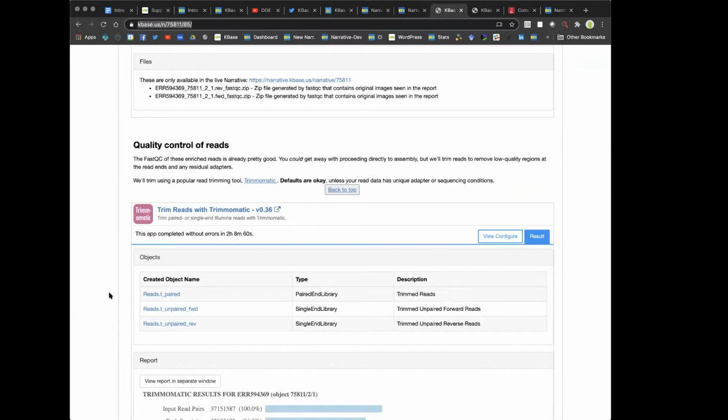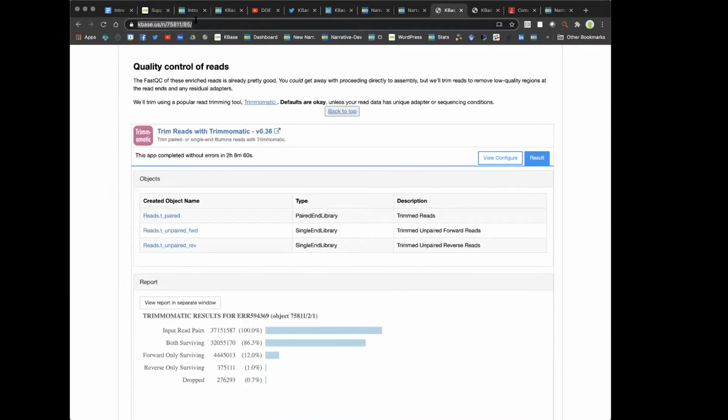So that's a very powerful tool for getting your work inside of KBase out there, and bringing people to your data and your analysis, as you did it on the system. So this is a very, very useful tool.